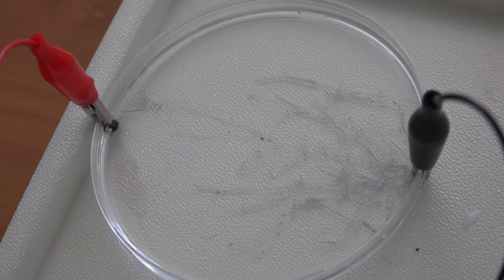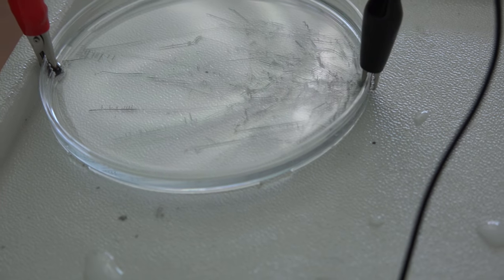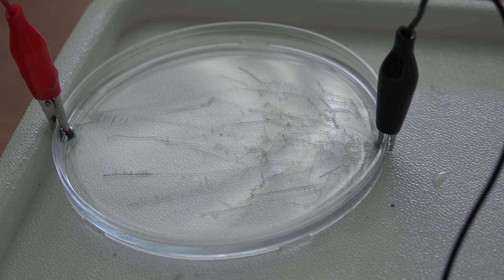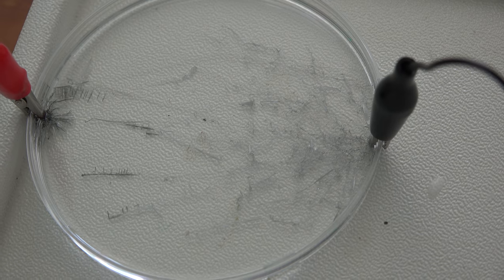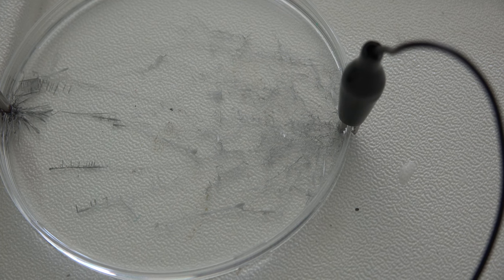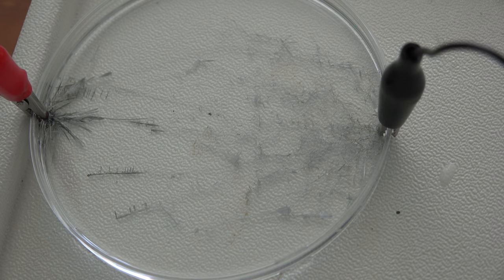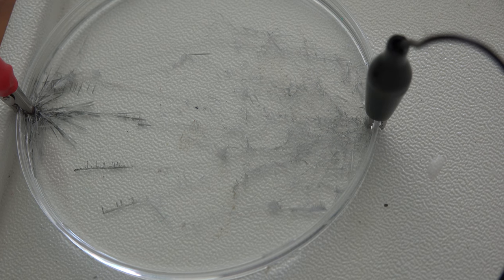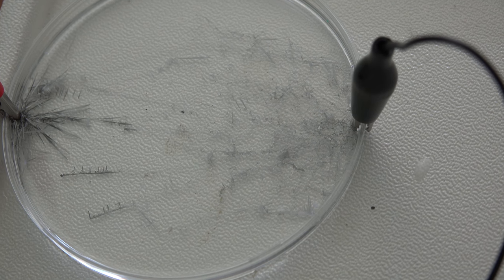Now all of a sudden it seems like it realized it went the wrong way and it's heading back over. According to the information in the app, if I reverse the polarity it will reverse the reaction — the lines going one way will pull back and disappear, and new lines will go from the red pole to the black pole. I have reversed them. I see new ones going from the red to the black; I don't see the other ones disappearing quite yet. They seem to be darker going this direction. The other mesh of lines does seem to be getting fainter — it's going back into solution.